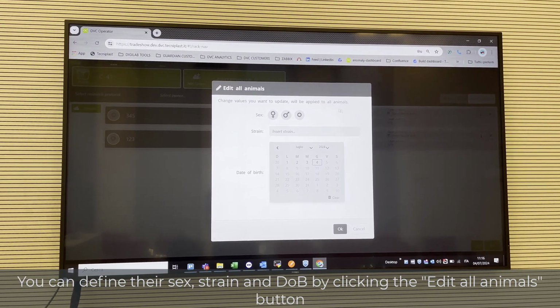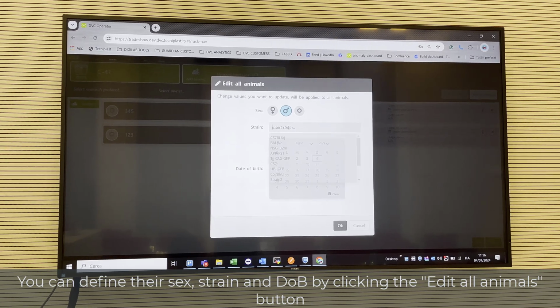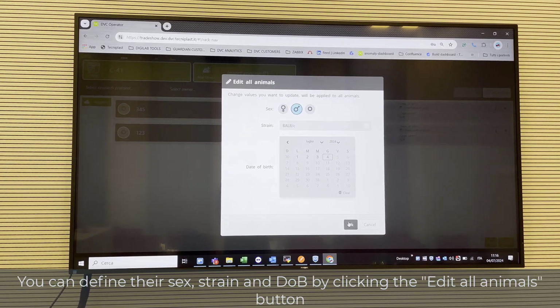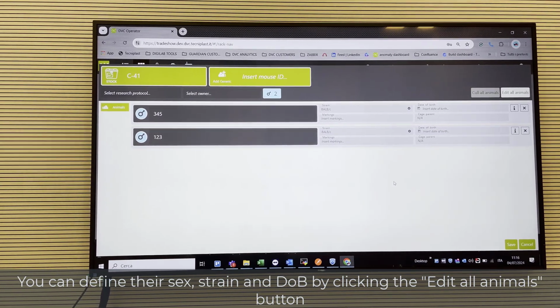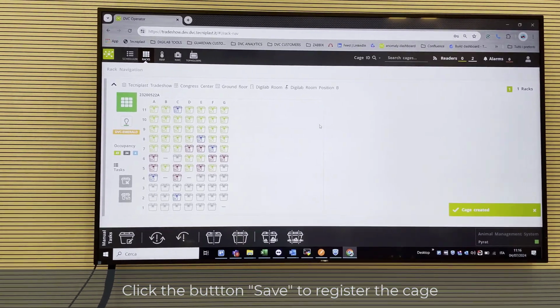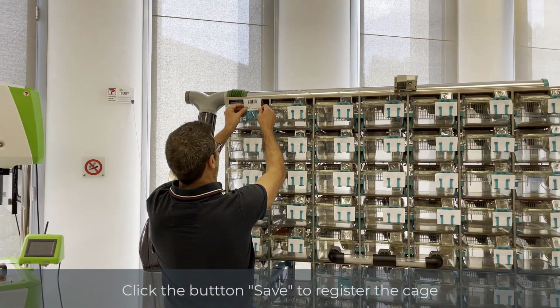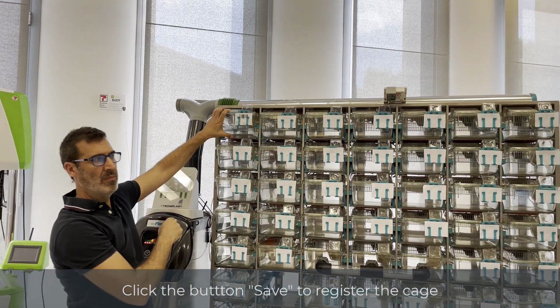Then, by clicking the Edit All Animals button, you can assign to all the mice the same information, like, for instance, the sex, the strain, and the date of birth. And that's it. Saving, it's already prepared, as you can see, and from this moment, this cage is generating data and is monitored by the DVC system.